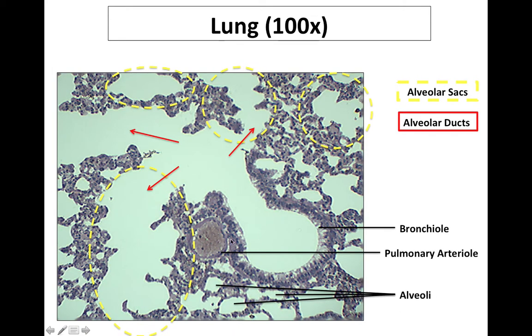So the bronchiole itself, if we begin to zoom in on it just a little bit right here, you're not going to see hyaline cartilage like you would have seen when you were looking at the individual bronchi. Okay, so it's a much thinner tubule, right? And it's going to have a thinner layer here around the outside. This is where you're going to still see quite a bit of columnar epithelium or cuboidal epithelium, depending at what point you'd see that cross-section made.